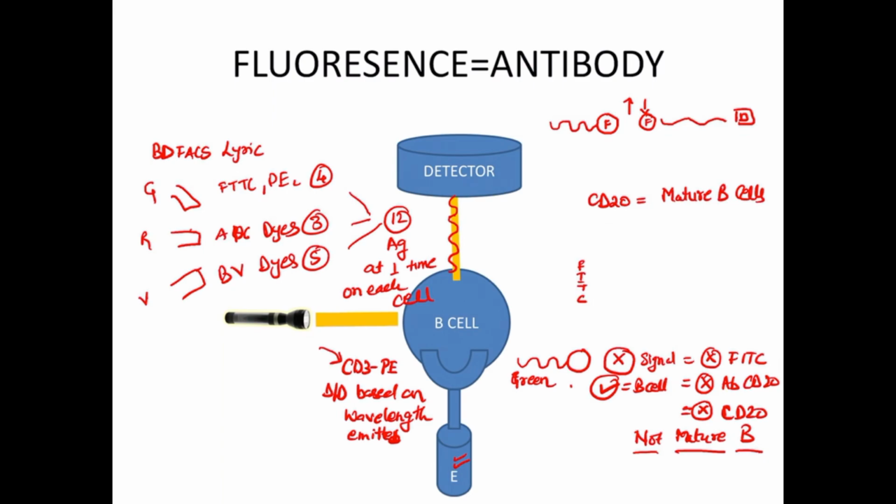Here we are multiplexing. This is what is called multiplexing, where we study almost 12 antigens at one time point. Now there are flow cytometers which are coming up with 26 fluorochrome reading capacity. However, those flow cytometers are more difficult to operate. Right now we are using a 12 color flow cytometer.